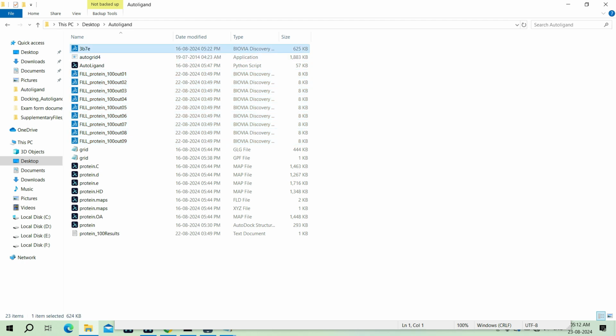So we will open the crystal structure of our protein, and we will strip out its chain A and visualize only the chain B along with the surface waters and the ligand ZMR in Pymol. So let's open our protein's crystal structure in Pymol.